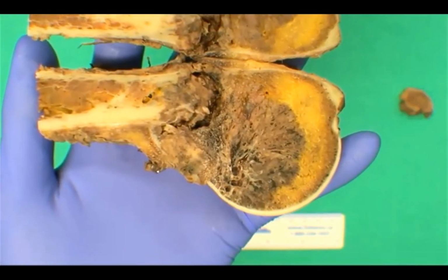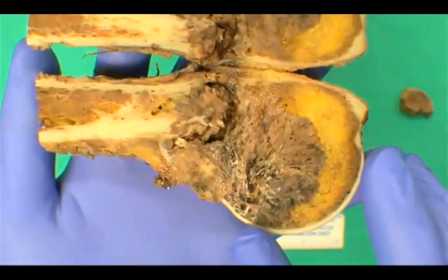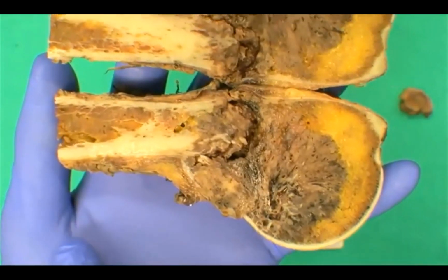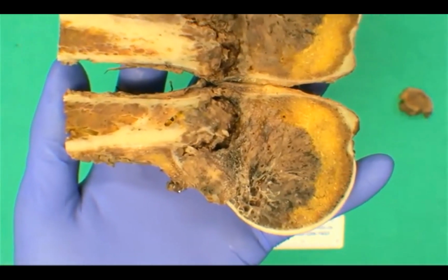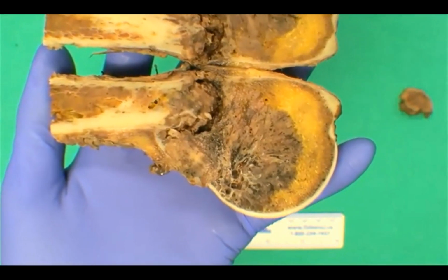It's variegated, it's spongy, as we can see. Measure the lesion in 3 dimensions and its proximity to the distal bone margin. With any bone case, we always want to double check the clinical history and identify what is going on so we can approach the specimen accordingly.